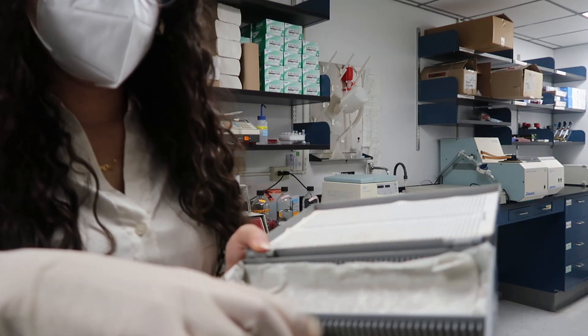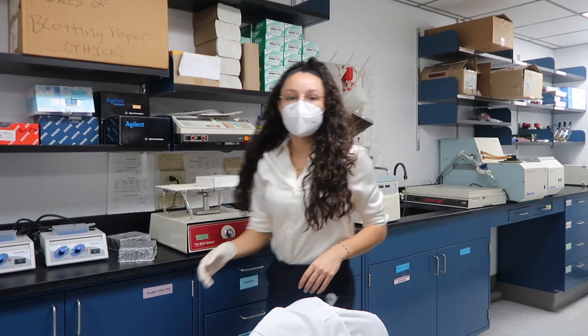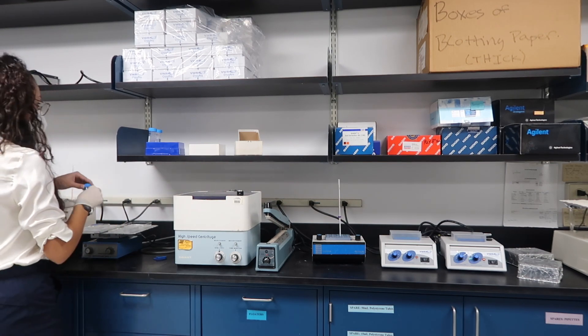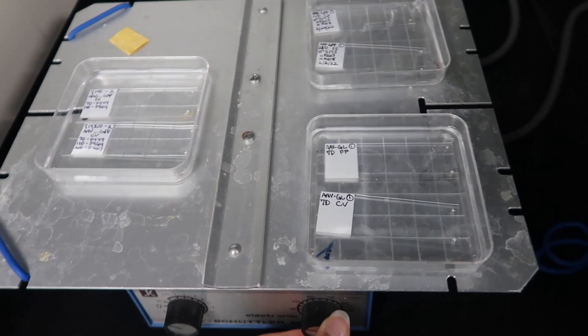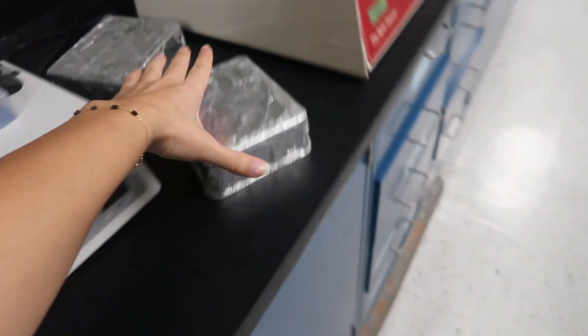Also going to put this away because we clean after ourselves. We're washing, we're washing, we're washing. Now we got to cover them up because they are light sensitive. And yeah, five minutes.